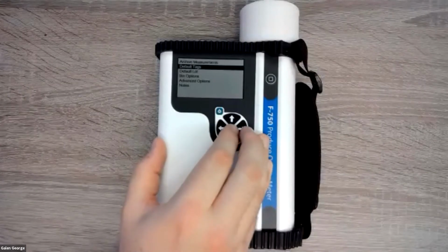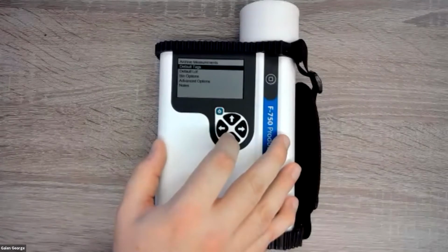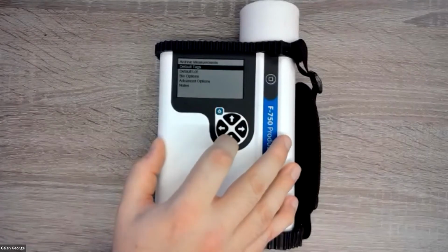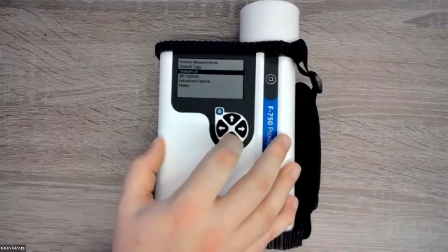You can see there's a default tags option. You saw there was that tags column in AppBuilder. This is where you can insert tags for the measurements you're going to be taking. Default lot is exactly what it says. It defines what your default lot is.